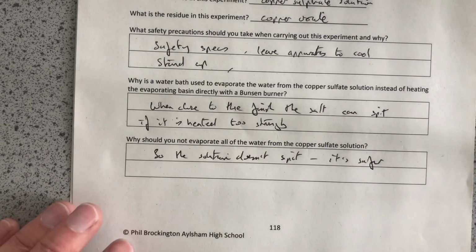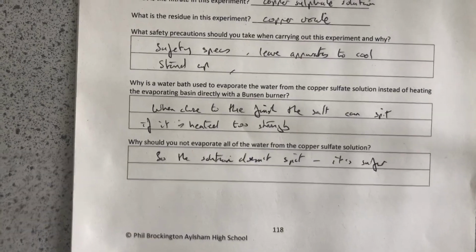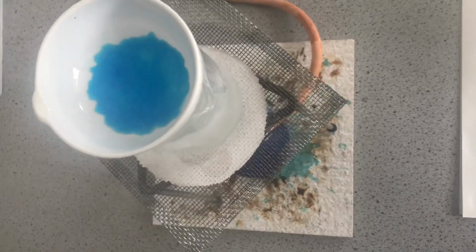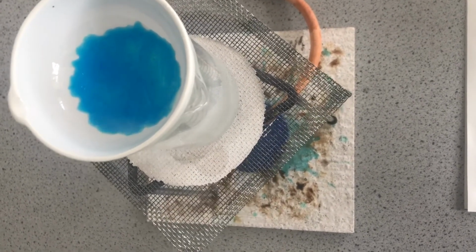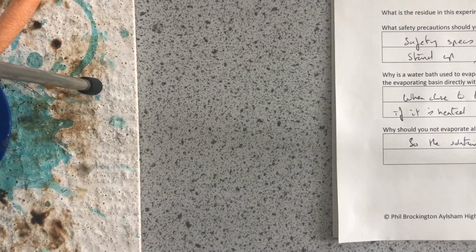Okay, and I think it's probably about time that we had a look at what we've produced. So if I lift the camera up now and maybe over the top of what we've got there, then we're still evaporating away, but we're almost to the point of crystals. So I'm going to turn that off now and let it cool, and we'll have a look at what's left after that.